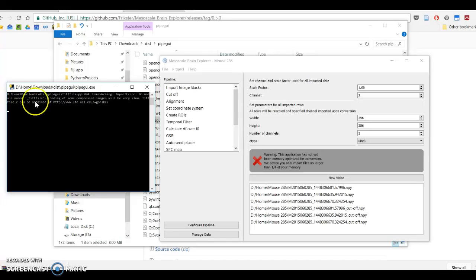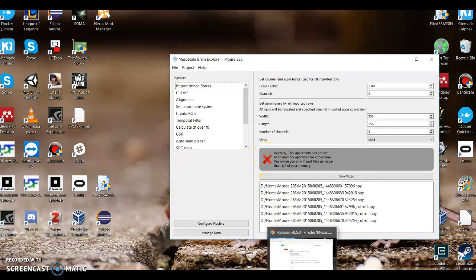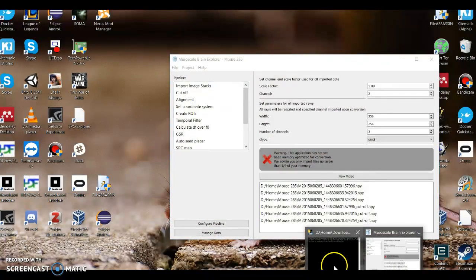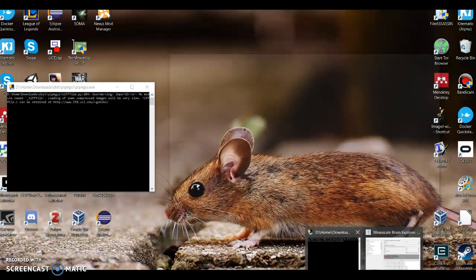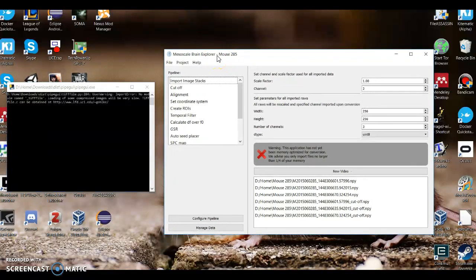You will notice, for instance, that TIFF files load slower in the exe version than when you're running it, say, via PyCharm as a developer. However, it's not slow to the point that it destroys the functionality of the application. So the "very slow" over here seems to be overstated. Okay.